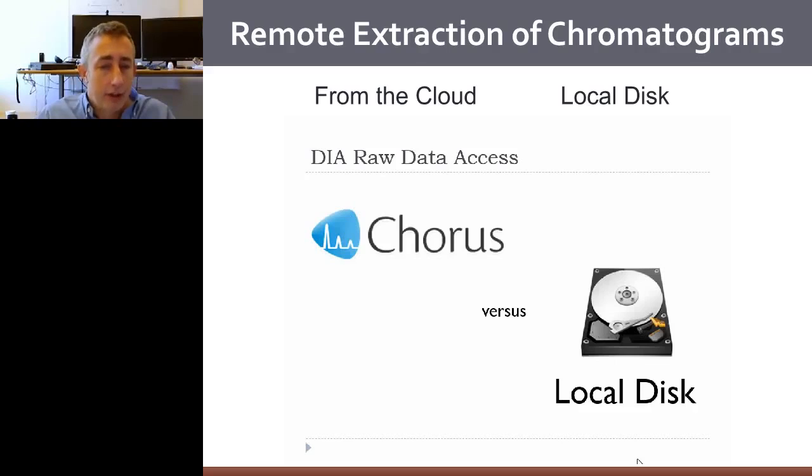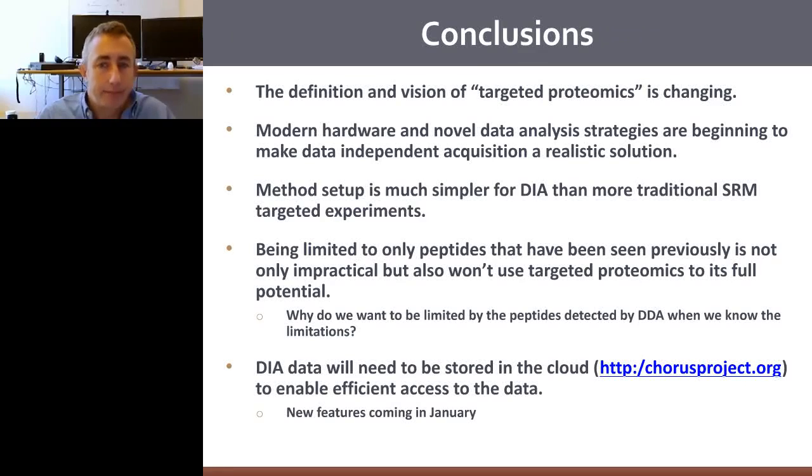So now, basically all 6 of the files have been loaded into the file on the left-hand side. We've still only loaded 1 data file from disk. And now you can go and start already looking at the data from the cloud. You can start to look at all the individual components. You can start to analyze the data. You can look at spectra, which again, it brings it from the internet. It's extremely fast, very low latency. Again, reading it remotely across the internet. It's just something that's to come.